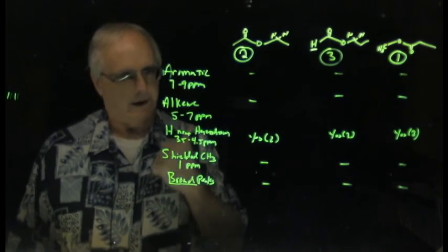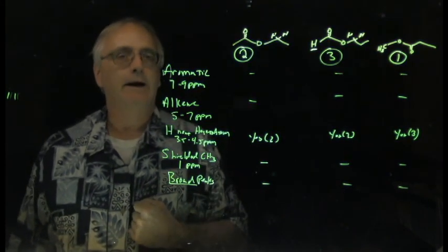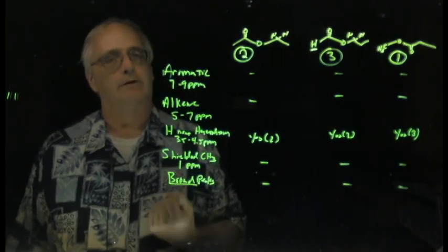So practice a few more of those. Get comfortable with these. It will help you. It will definitely help you a lot as you begin learning to understand and interpret NMR spectra.